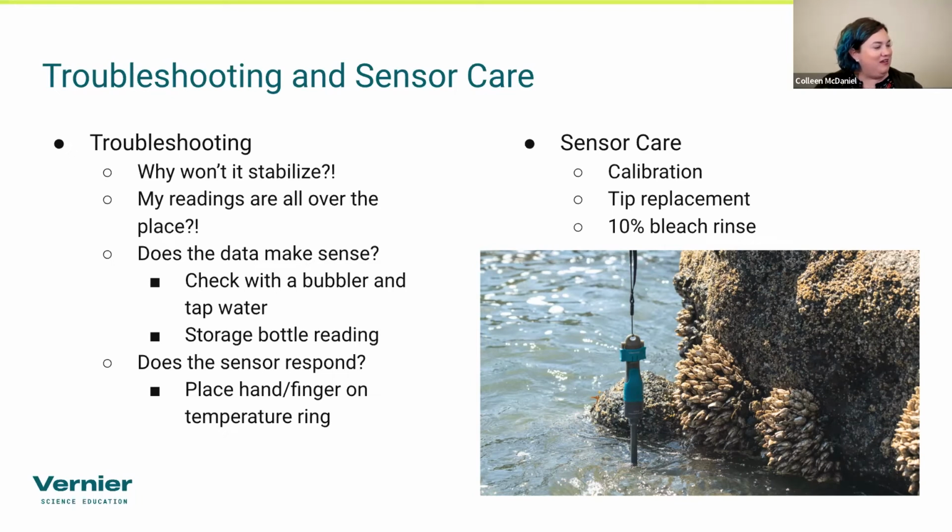Is holding the Go Direct probe, will the warmth of their hand have an effect? It can, especially if they're holding it down here. Up here, there's not going to be any effect from the warmth of their hand. It's all about this metal band right here. I have been able to get it to change just based on the warmth of my hand around the storage bottle. Luckily, their hand's usually not in that location when they're doing actual readings, so it's not something we have to worry about so much.